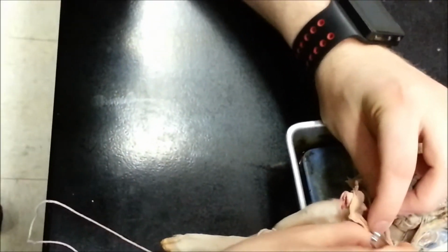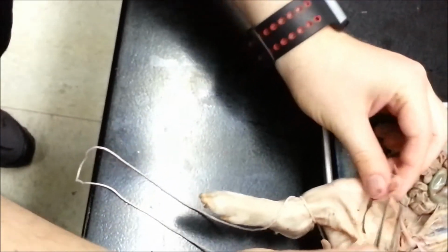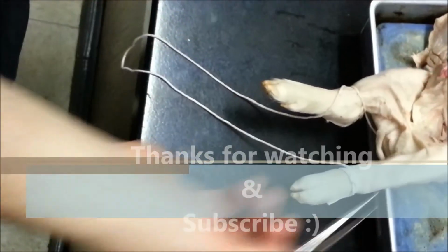So the last two are going to be the internal iliacs, and this is going to be the external iliacs. The internal iliacs eventually go into your umbilical cord, the umbilical artery, and this one's going to go into the legs. So it's going to be your external iliacs.